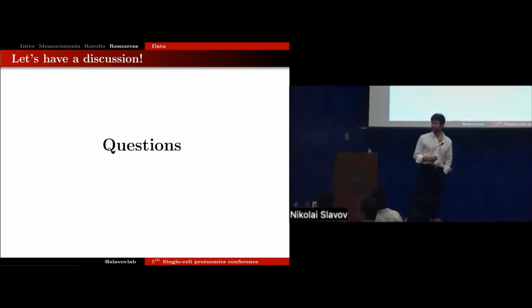Hi, beautiful summary. Thanks a lot. Also very nice results with the plexDIA. I'm going to talk to you a lot the next 2 days, but maybe just for this purpose, I was very interested in your MS1 versus MS2 peak comparison of your top three. So were there any conclusions in terms of overall discrepancies between the two? I mean, there's a lot of discussion in the field of should you use MS1 quant with DIA or MS2 quant, and I guess you have a perfect data set to evaluate that, especially with a single cell resolution.